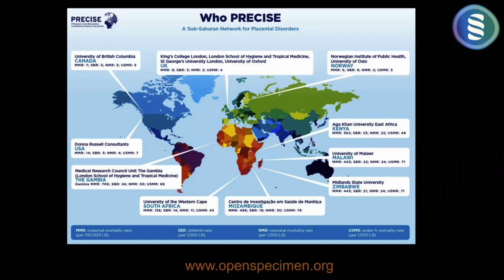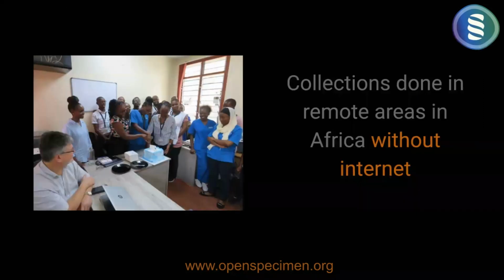So you can imagine that a handheld device is much easier in such a scenario than using a laptop. But the other, bigger challenge is that there is no internet when you go out, especially if you're in a village in Africa. So there is no internet, and that is where our mobile app comes into the picture. The collections are done in remote areas, maybe in schools.